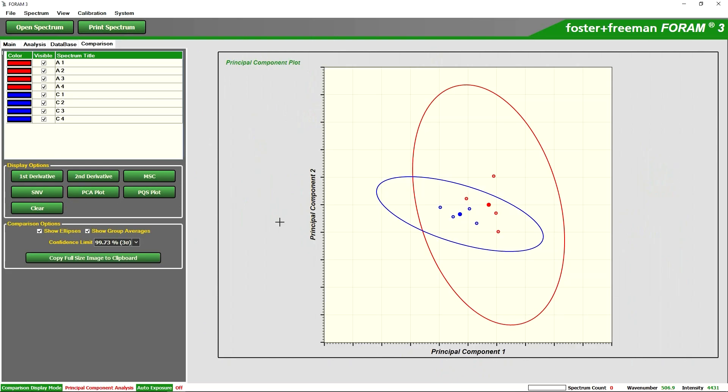We can also plot the PCA, the principal component analysis. In short and in summary, the fact that the two ellipses are overlapping each other is a statistical indication that these graphs are very similar and this is to a confidence limit of three standard deviations.